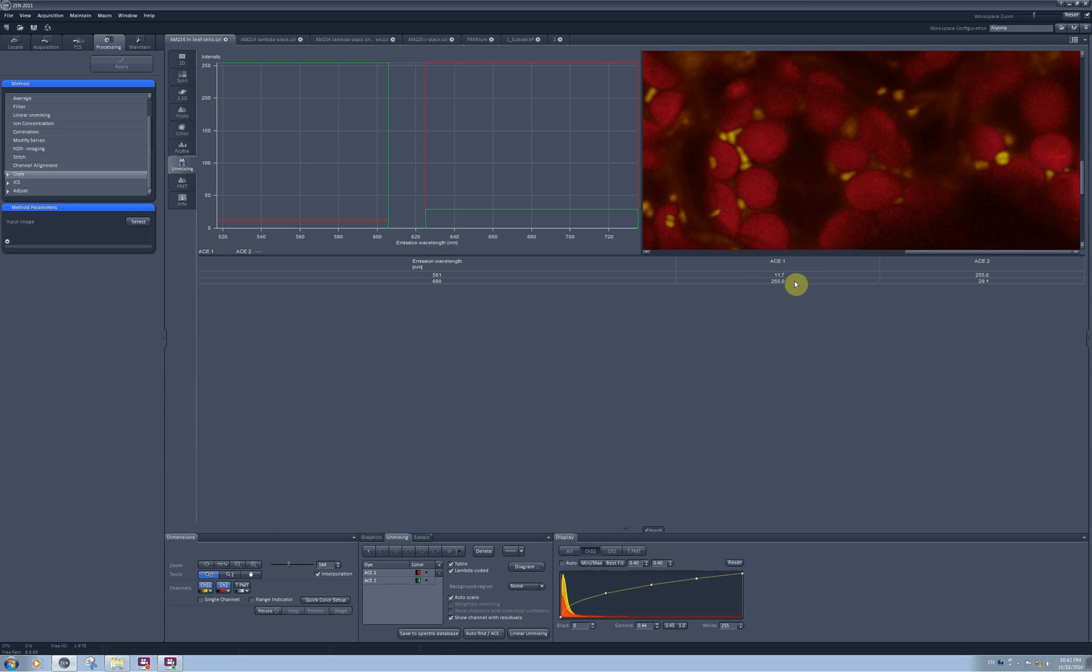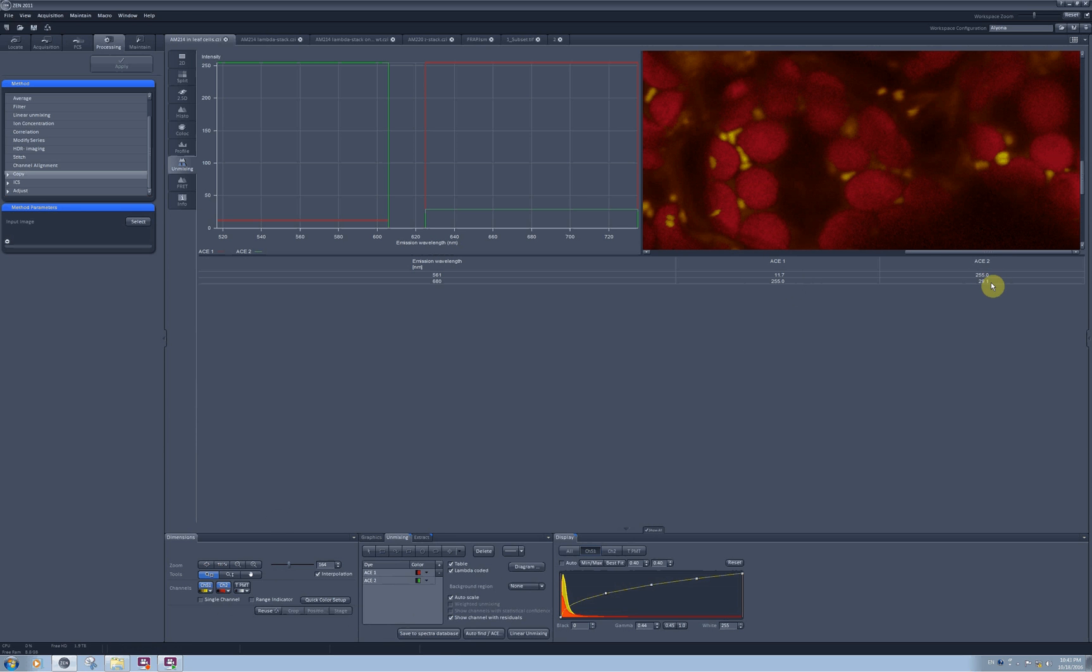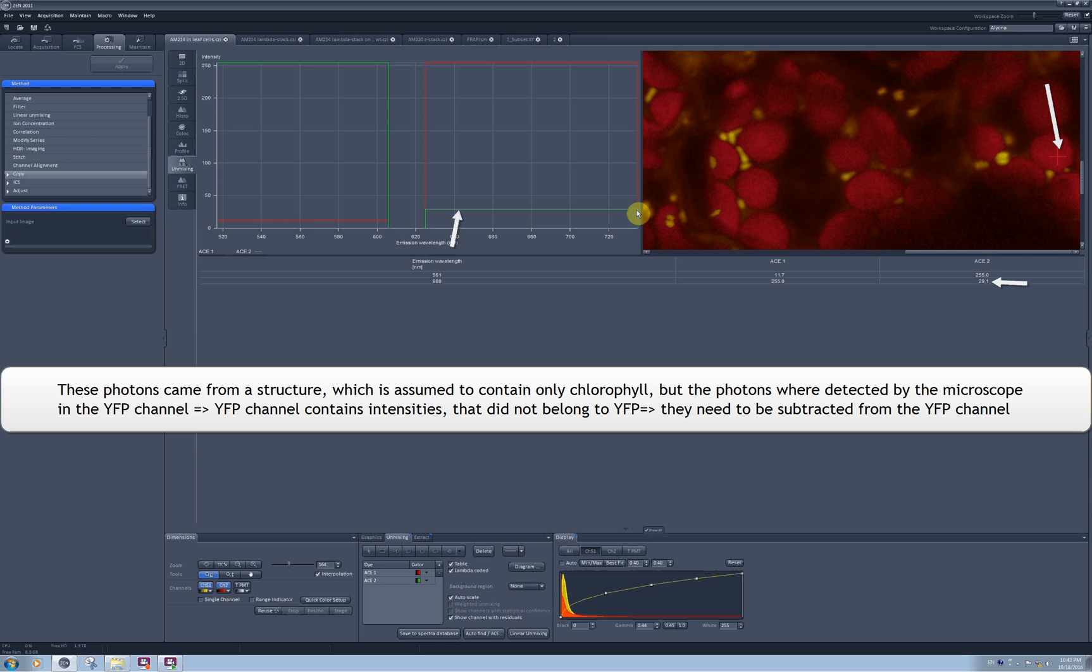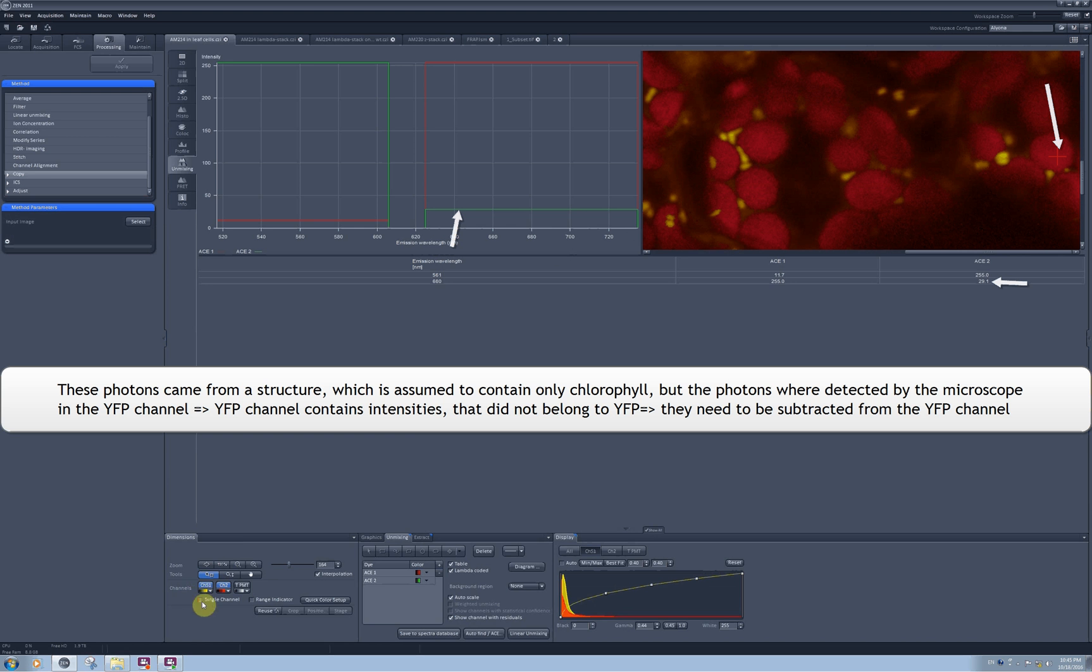The intensity in this spot in the red channel was 255, and then it detected that in exactly the same pixel, but in the green channel, I had pixels of intensity 29.1. The software will automatically assume that two fluorophores cannot be present in the same pixel, which means that this intensity in the ChS1 channel was the result of the chlorophyll leaking into it, which means that this intensity should be subtracted from all intensities in my ChS1 channel.